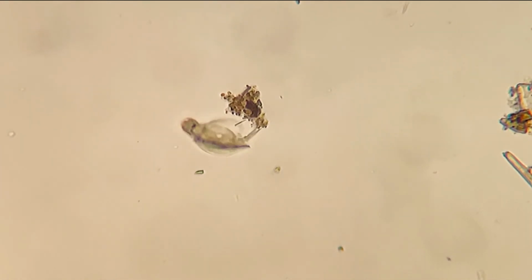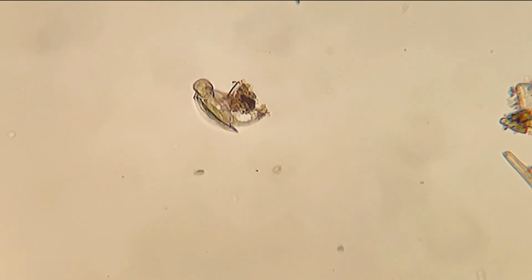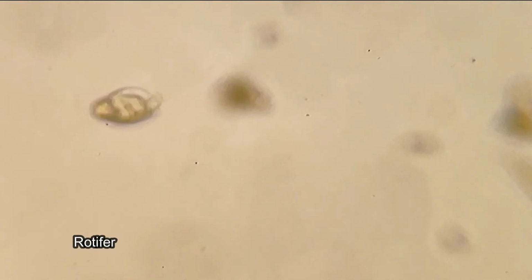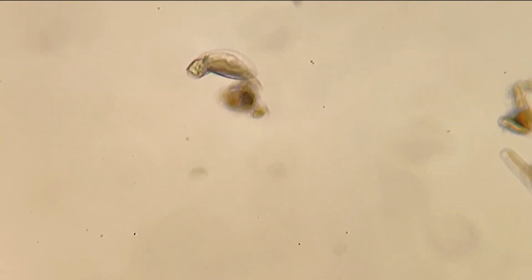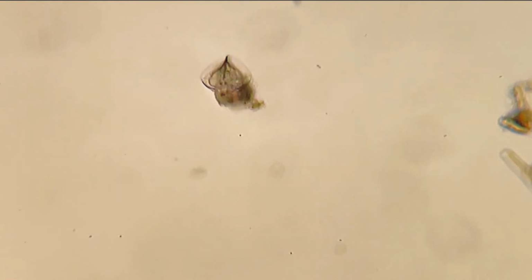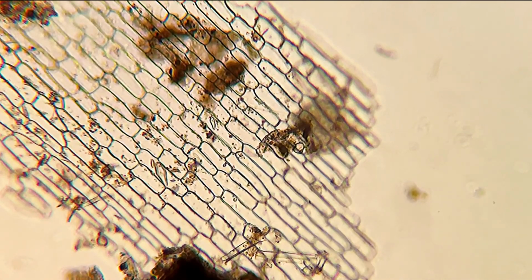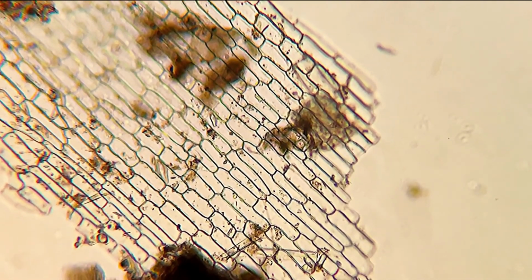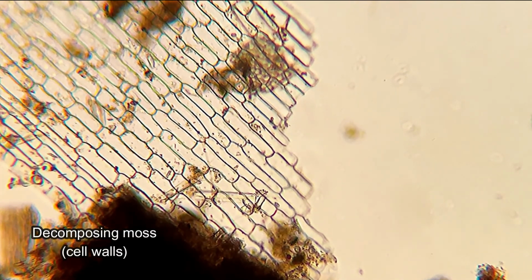This microorganism is actually a microscopic animal called rotifer. Rotifers are a very important part of the freshwater plankton. We are going to finish this video admiring the beautiful pattern of another piece of decomposing moss.